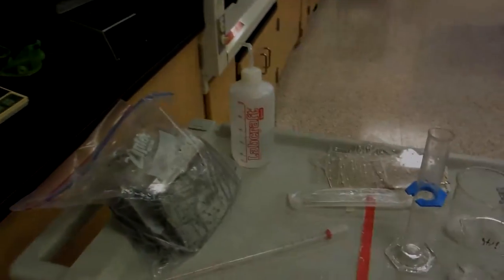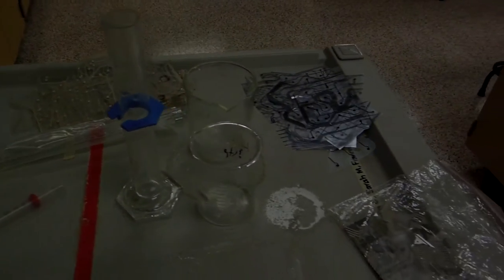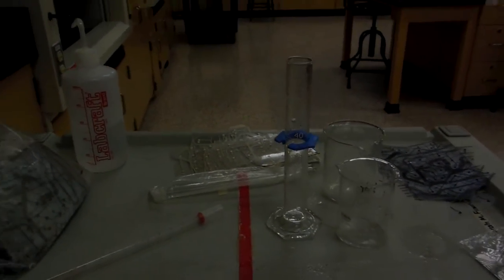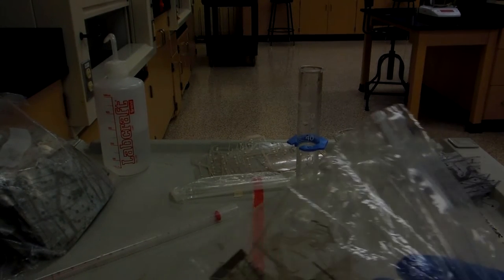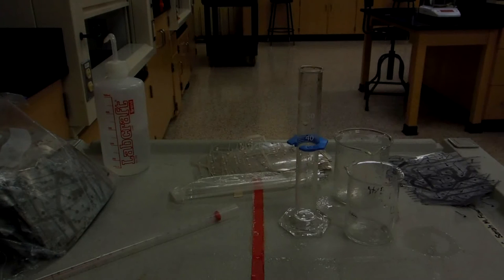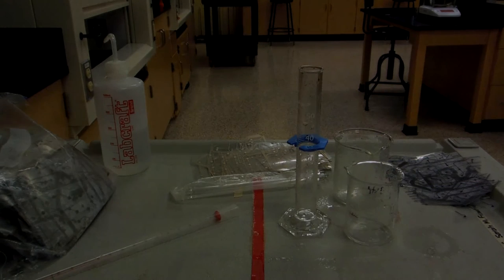On the cart I have the rest of the items that I need. On the very left, I have a bag of silver Mylar ready for processing, a wash bottle, a thermometer for a later step, some glass stirring rods, some various beakers, a graduated cylinder, and some processed silver Mylar. Notice how black the traces are. That's because I dissolved the silver in the nitric acid solution, and the black traces are residual carbon left on the sheets. Also, I just showed a bag of Mylar for later dissolving.